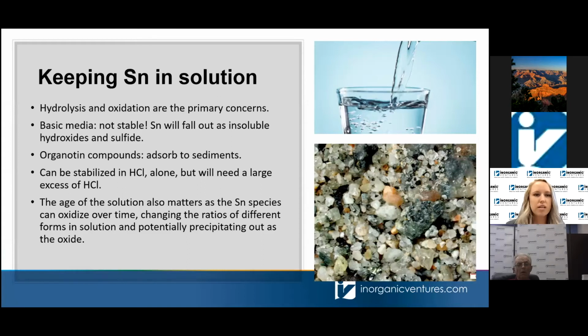So again, the hydrolysis and oxidation are the main concerns for tin. Similarly to what we saw with mercury, you're not going to want to have tin in a basic media because the tin will fall out as the insoluble hydroxide or sulfide.